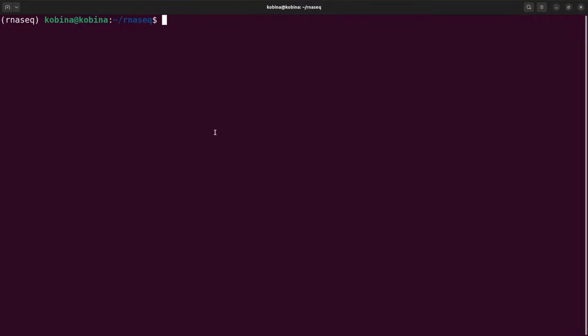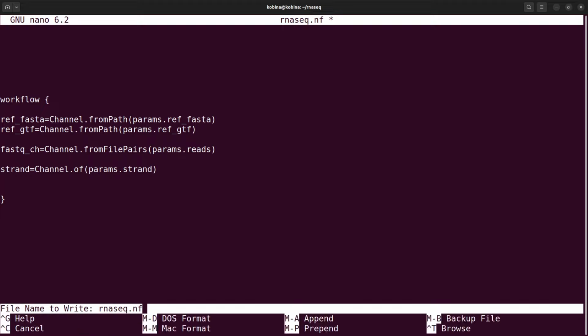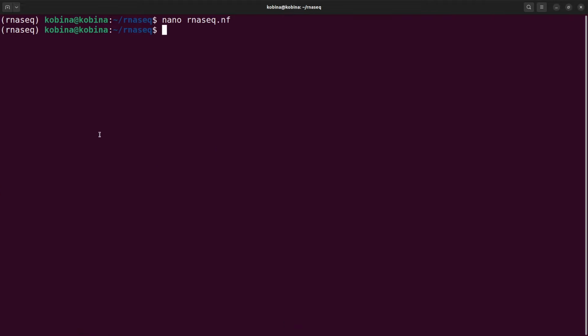Okay, now we've done a test run. Everything seems to be fine. So I'll do nano RNA-seq, and I'll clear some of the information. So we don't need the .view. All these ones, we don't need them. I only did it to make sure that my input files are there. Okay, so that is fine. So I'll exit, and then we can proceed.